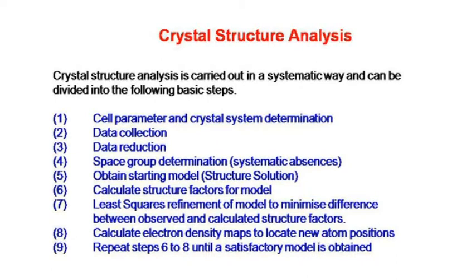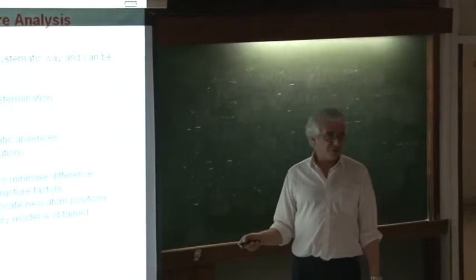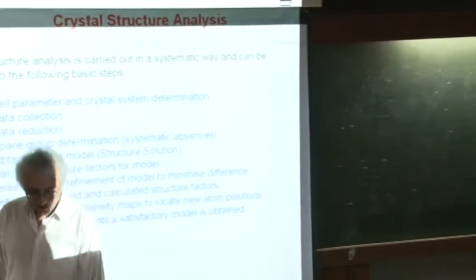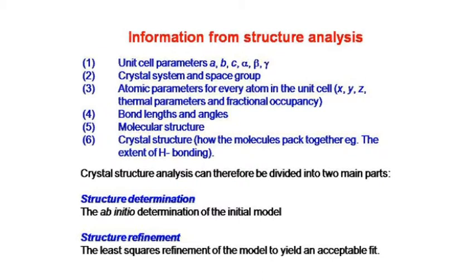It's a very simple process, but you need to know a little bit of crystallography to do it. Not so much these days. In fact, there are programs which are more or less black box: you come along, here's my formula, this is what I want out at the end, and hey presto, in about 10 minutes you have a crystal structure. It's when it's wrong and you don't recognize it's wrong, that's where the problem is.